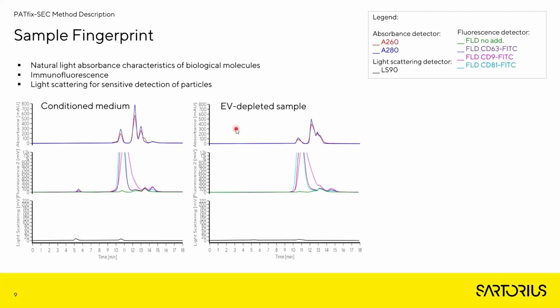Here we have the EV depleted sample. We can see some small components, including proteins, present, while there are almost no particles detectable.